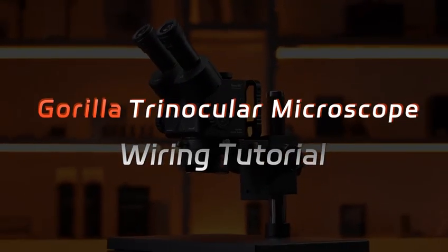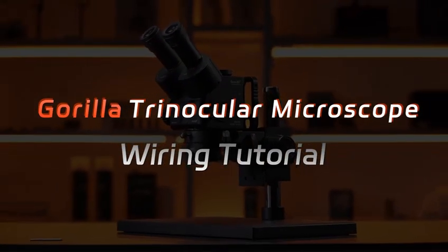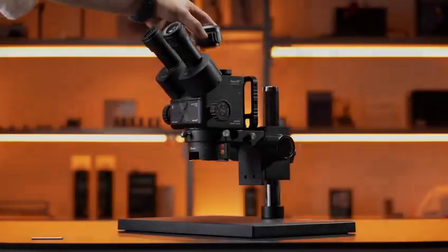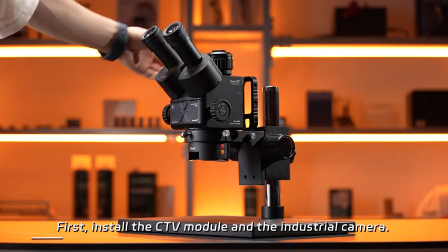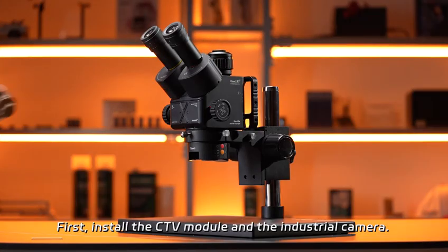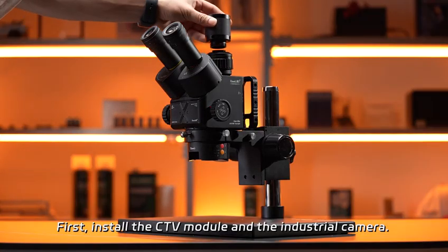Gorilla Trinocular Microscope Wiring Tutorial. First, install the CTV module and the industrial camera.